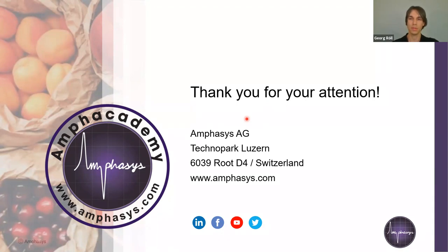Do you have something to add, Silvan, to that question? No, just that it really depends on the stability of your pollen. Stability of the pollen in general, how fast does pollen deteriorate? In tomato and pepper, we are very lucky. This pollen is extremely stable, so leaving it for a few minutes or even hours doesn't really change so much. In Georg's session right afterwards, you will see a whole different scenario.